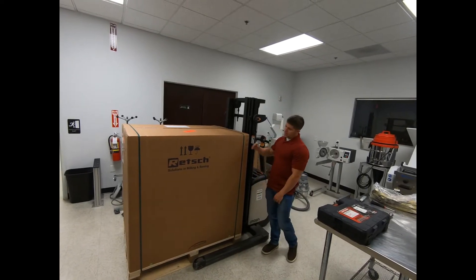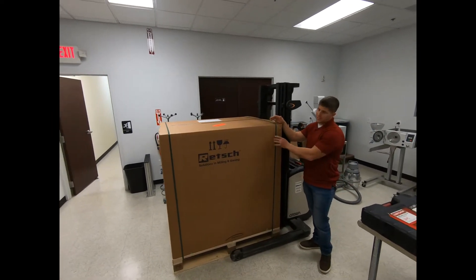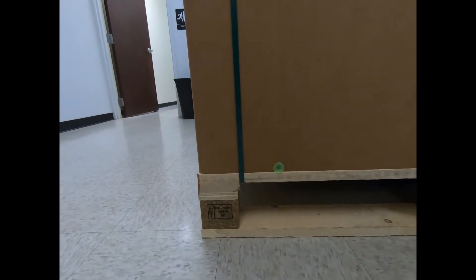The first step to unboxing your RS200 is to cut the two plastic straps on each side of the box, and you're going to have eight supporting nails to take off on each side of the box.